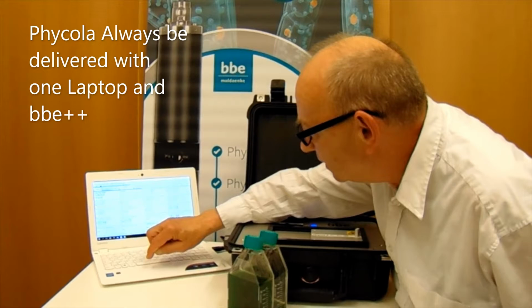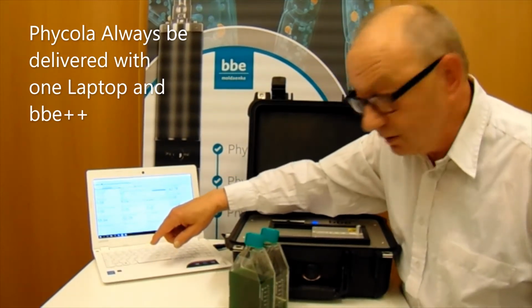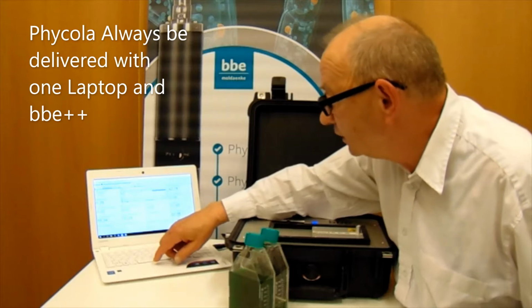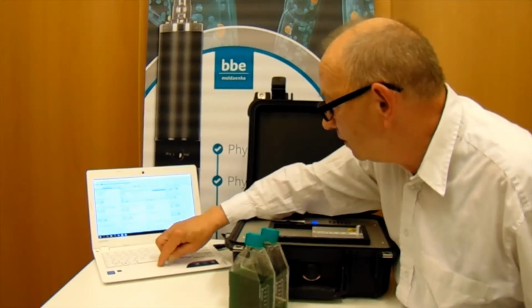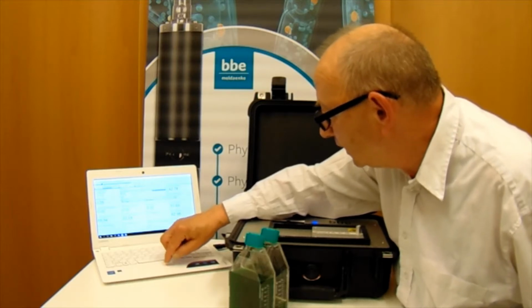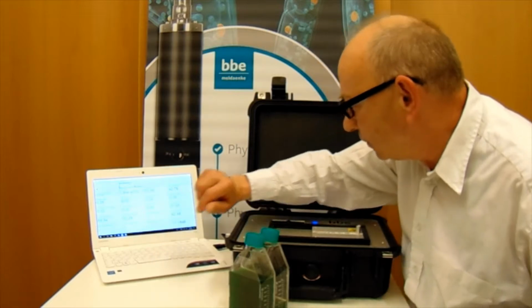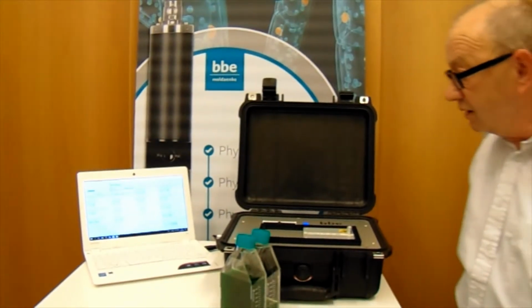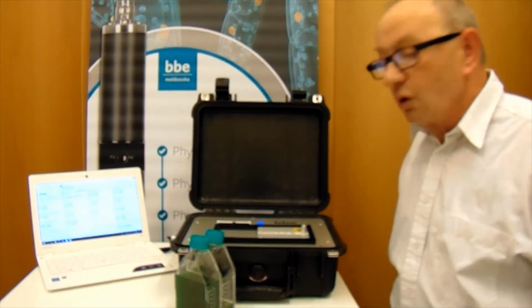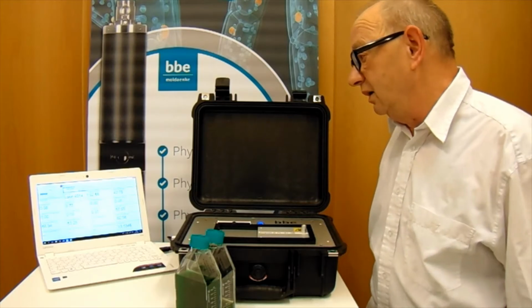and just start here now. I have to add, of course, a comment. If you like, you can do this here. I use this one. And then I go again to start the process. This bar shows you the progress of the measurement, and we have to wait a little time, but everything runs automatically.